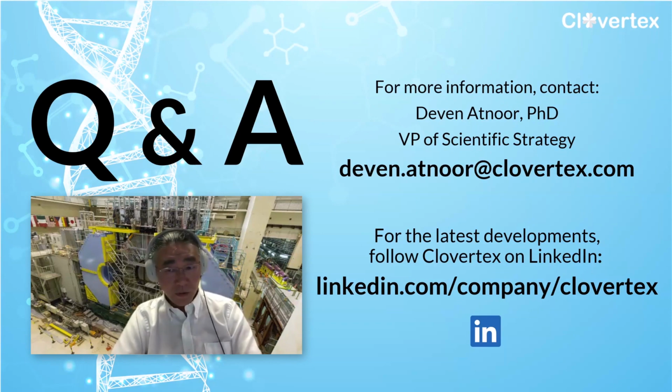Still, you get lots of crystalline ice contamination on top of the surface of the thin membrane of vitrified ice, and these kinds of components we can't avoid. So we are trying to get statistics by running many datasets at this point.